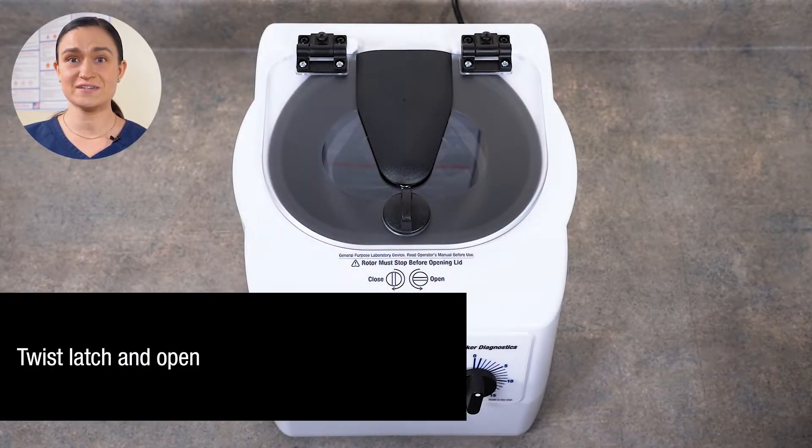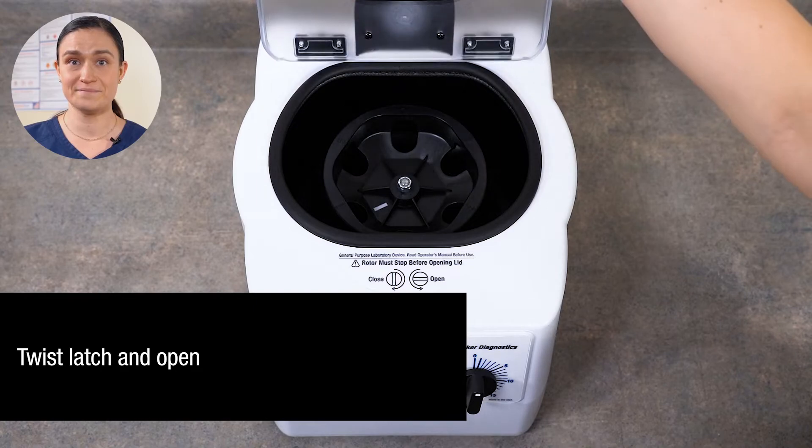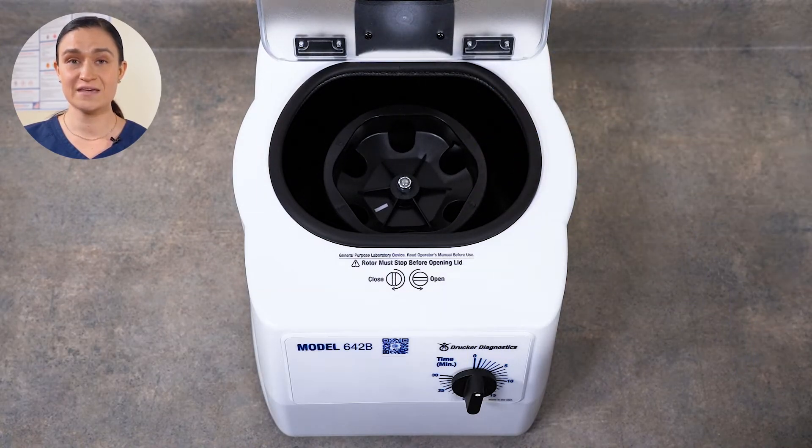Now we can twist our lid latch and lift the lid open. You can see our rotor here inside. Your 642B comes with its rotor installed and ready to run. All we need to do is place our tube holders.